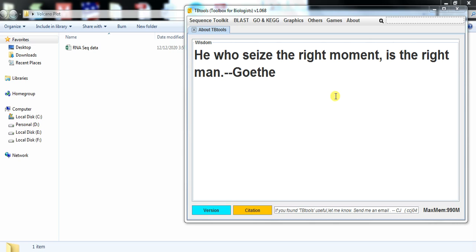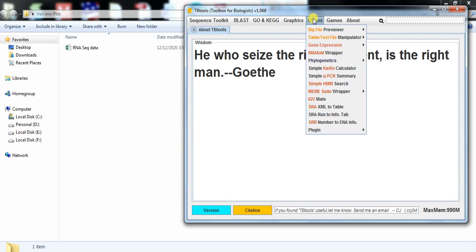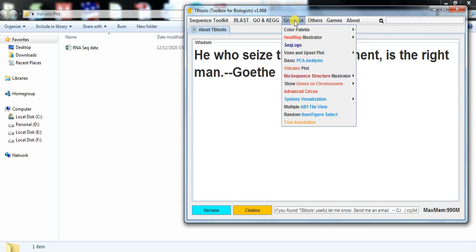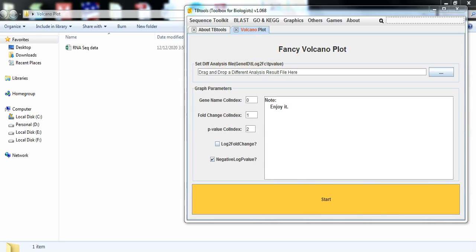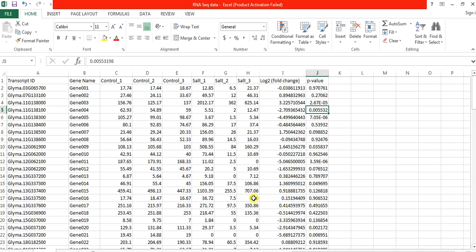To do that, you need to open the TBTool, go to graphs, select Volcano Plot. So here it needs the file that contains gene id, log2 fold change value, and p-value. So that we will get from here.